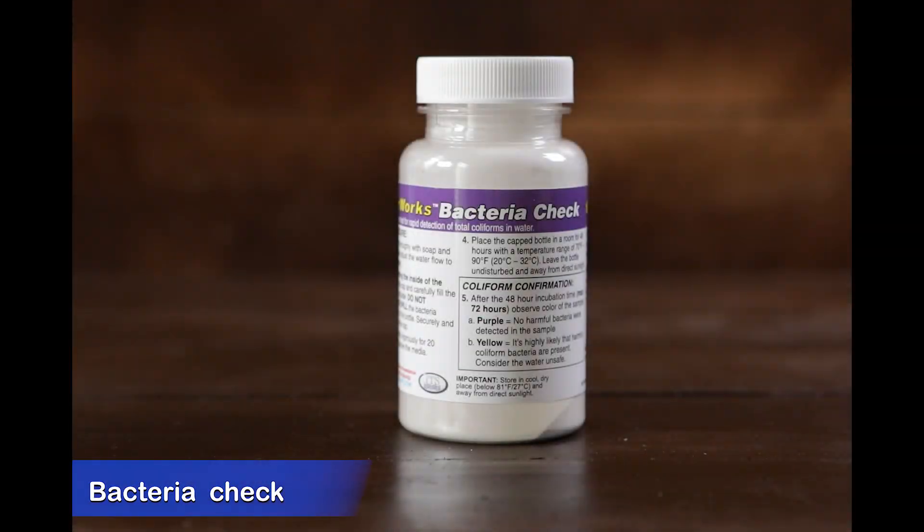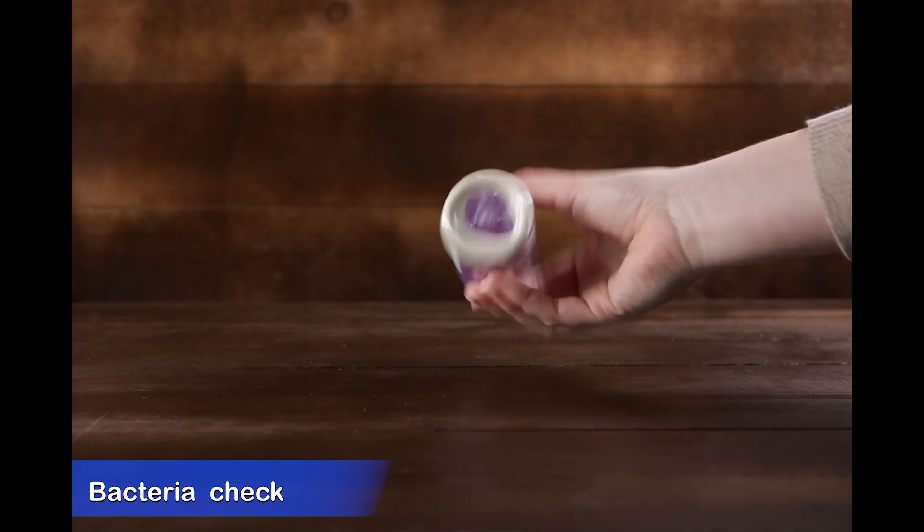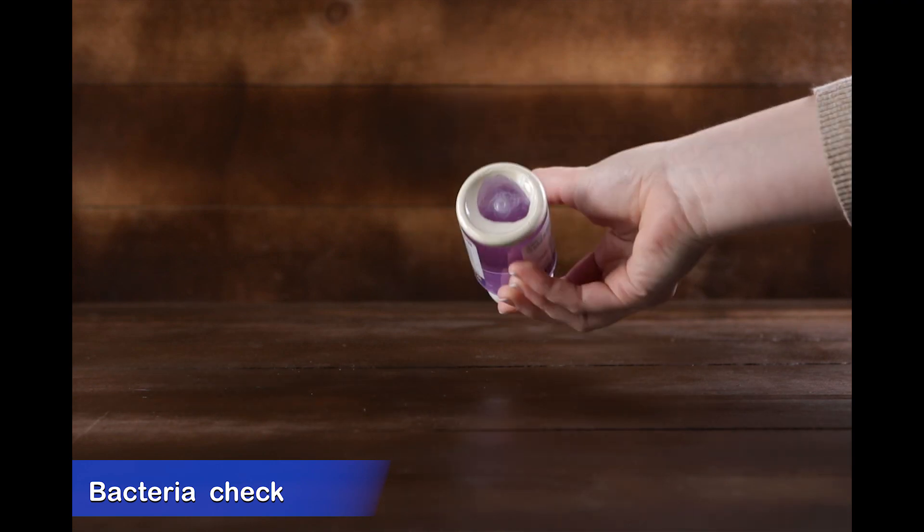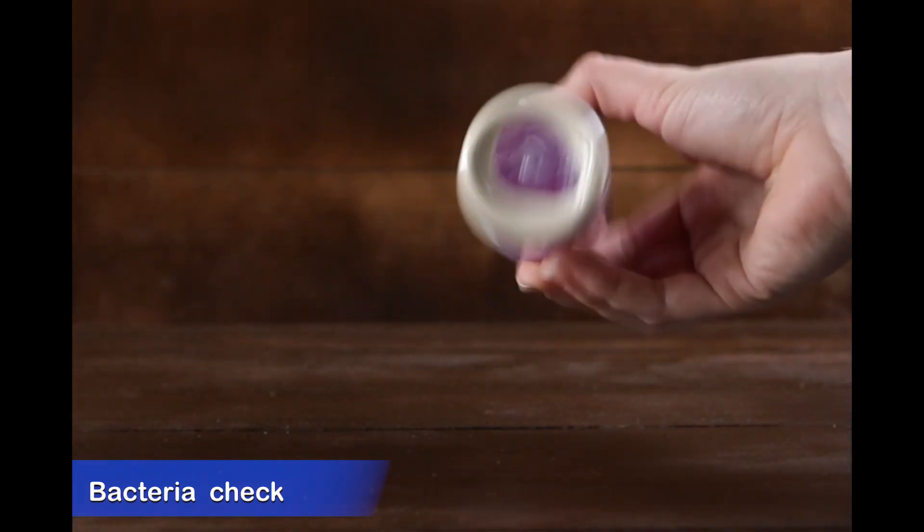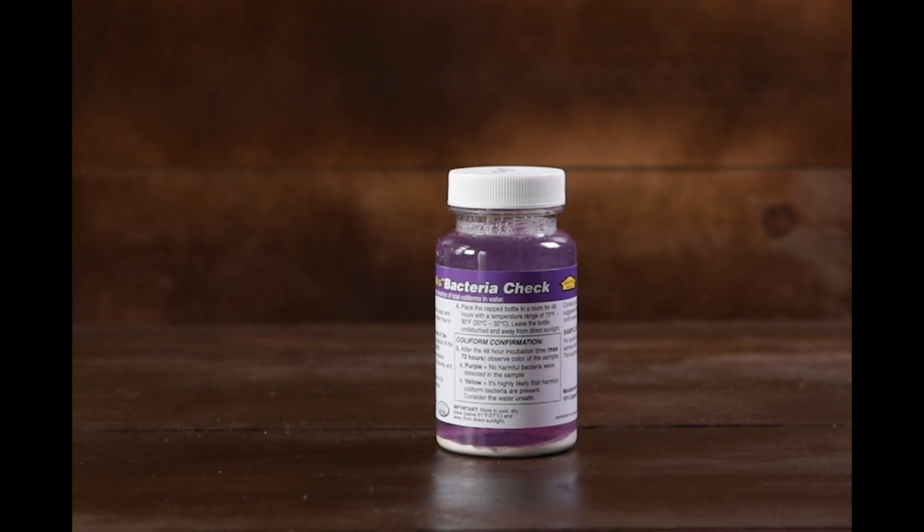Test for bacteria by filling the jar to the shoulder with water. Cap and shake for 20 seconds. Place the jar in a room with a minimum temperature of 70 degrees. The jar should remain undisturbed and out of direct sunlight for 48 hours.